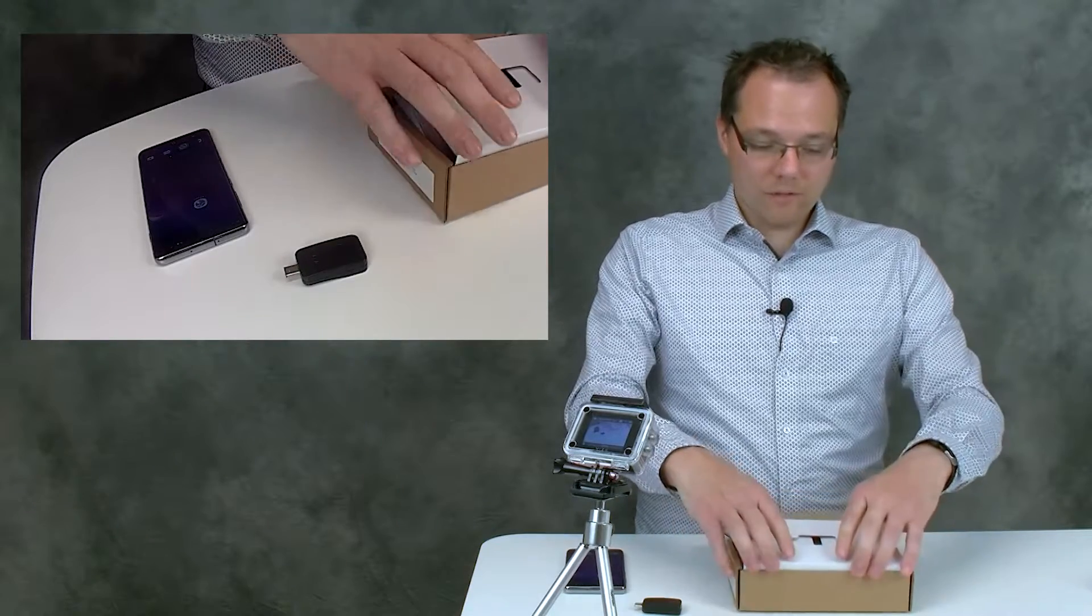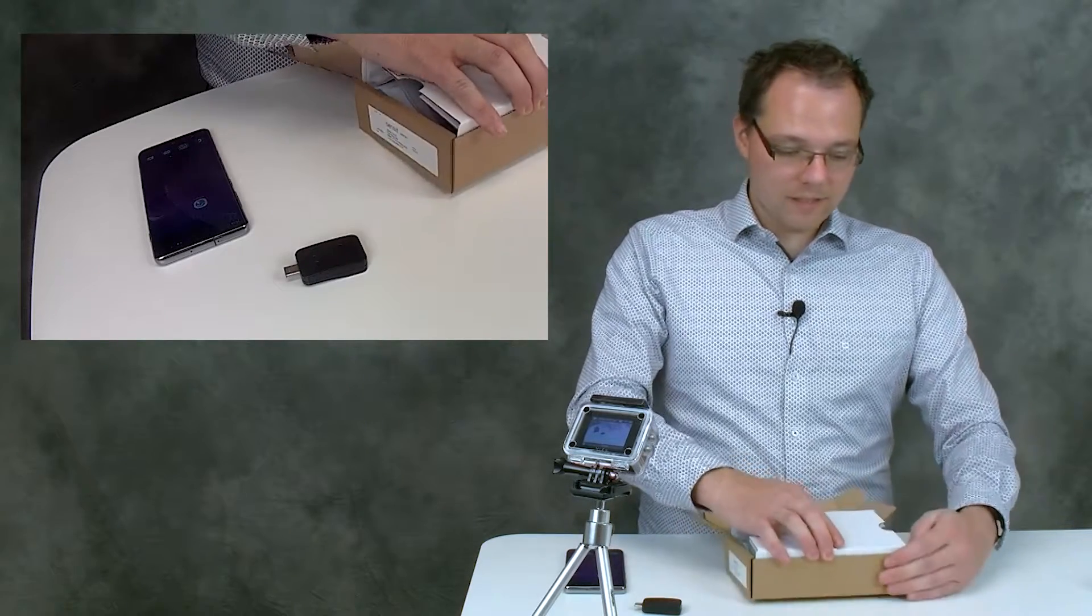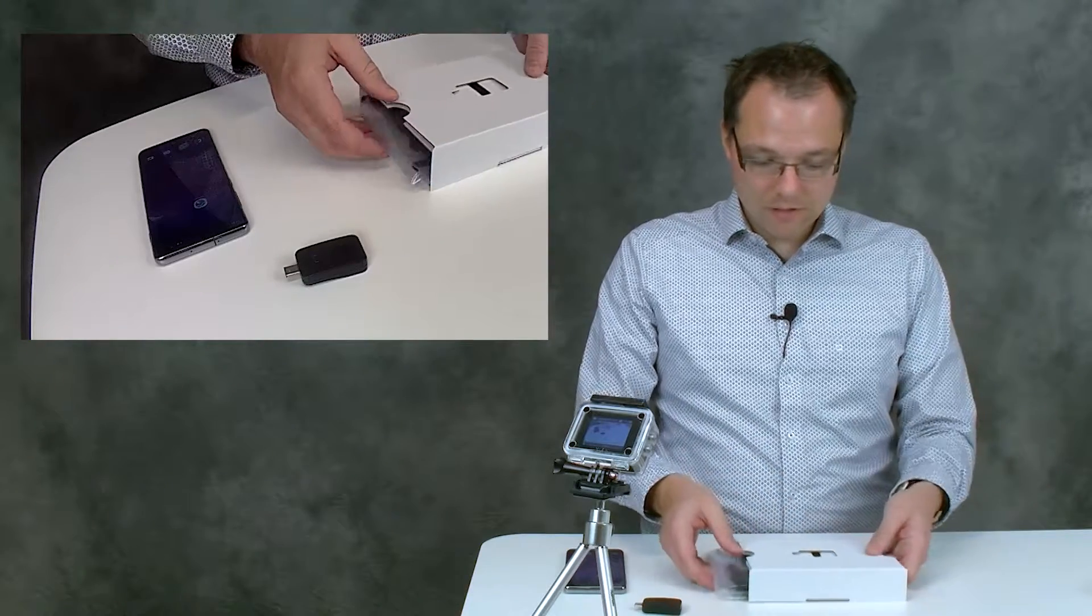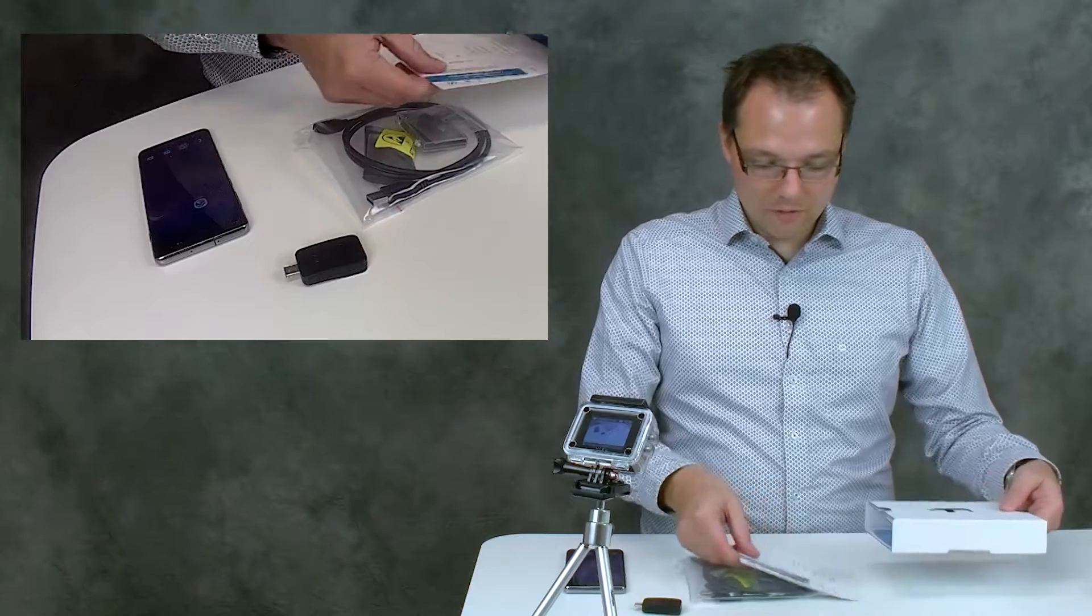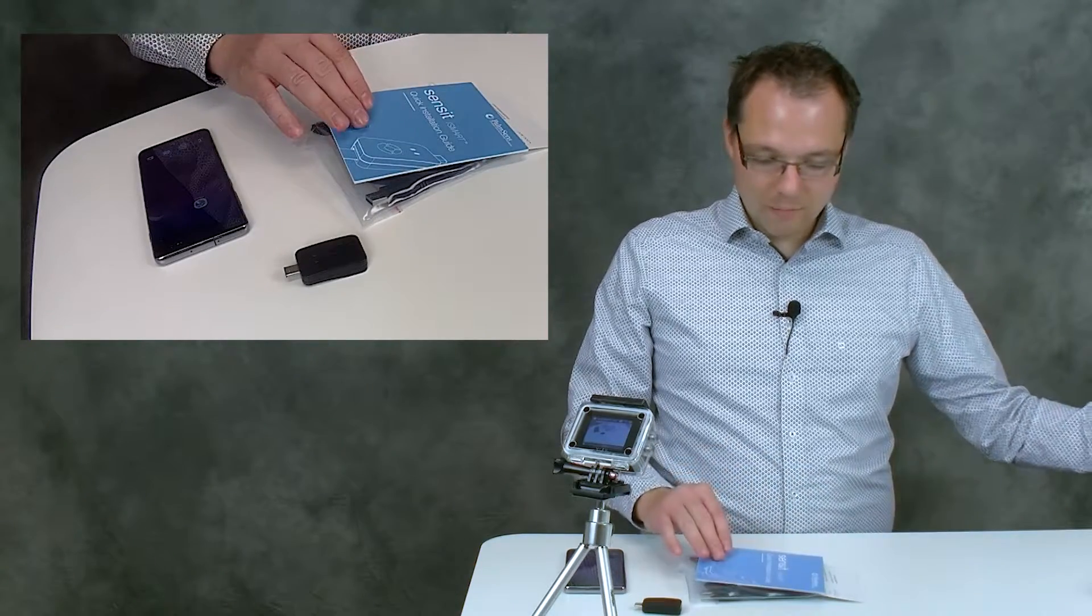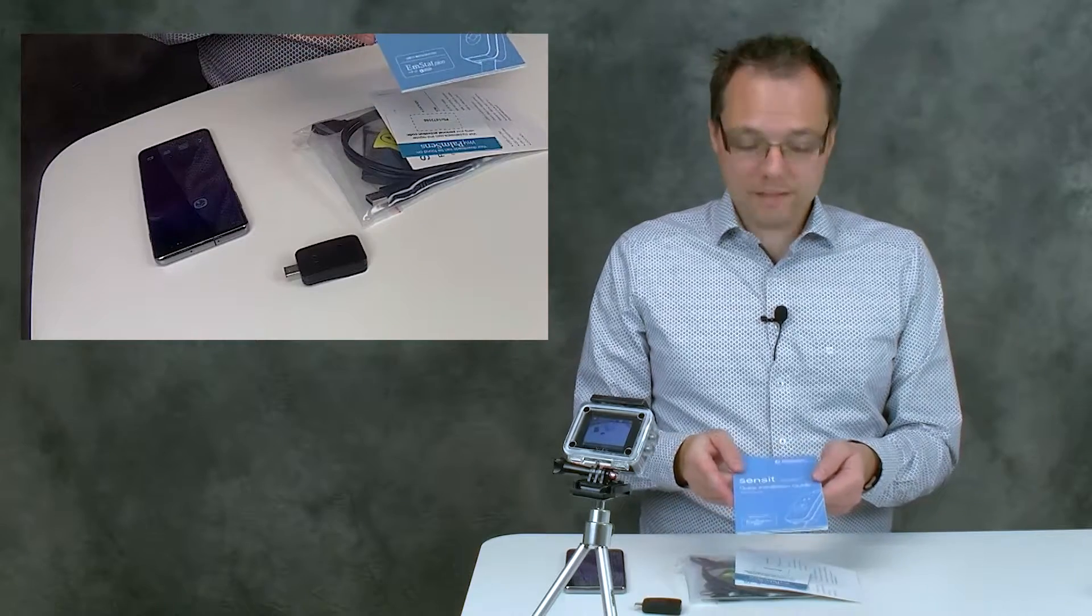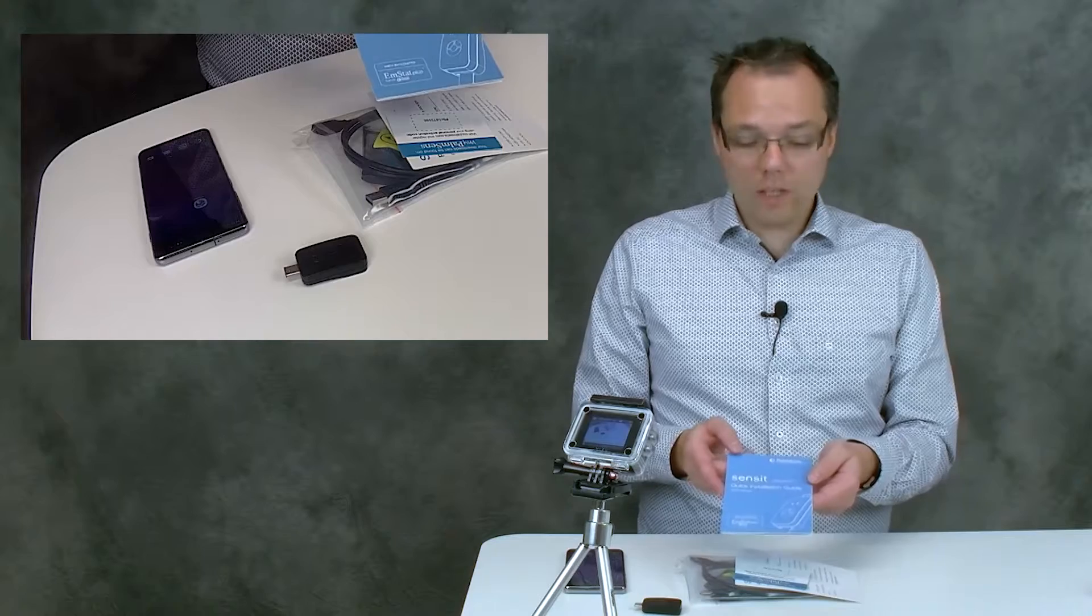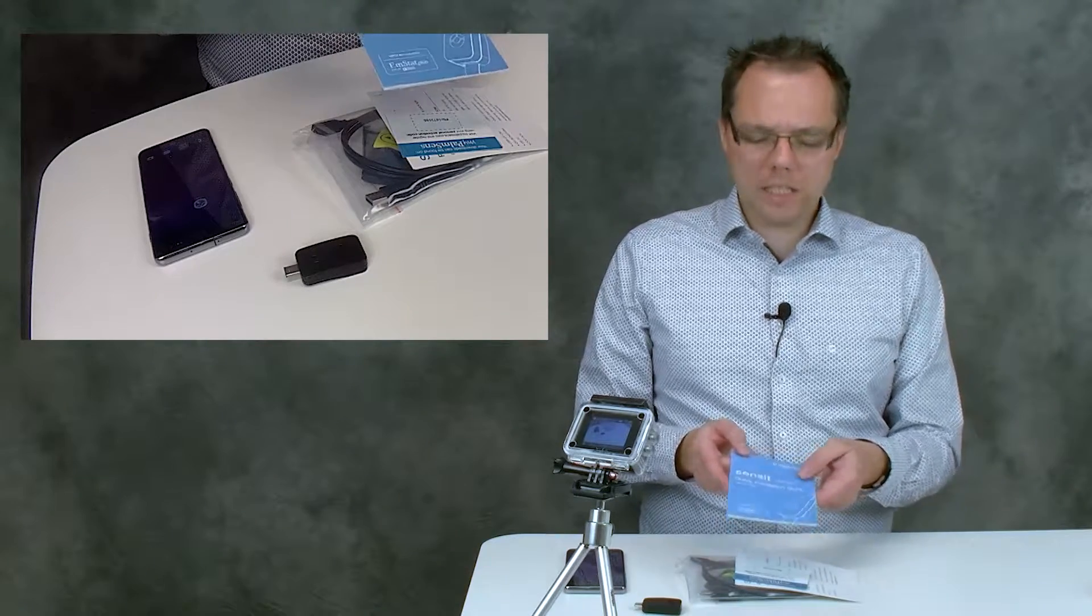All the rest of the accessories that come with a Sensit Smart are inside this part of the box. You can just slide everything out. You have, for example, the quick installation guide. You can use that if you're not a fan of videos and prefer reading this.